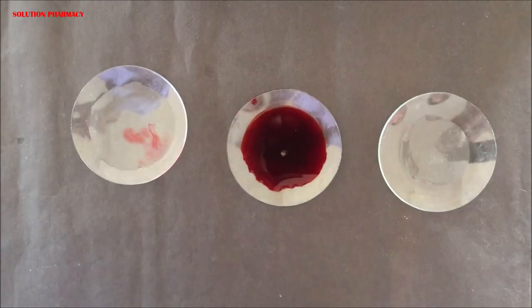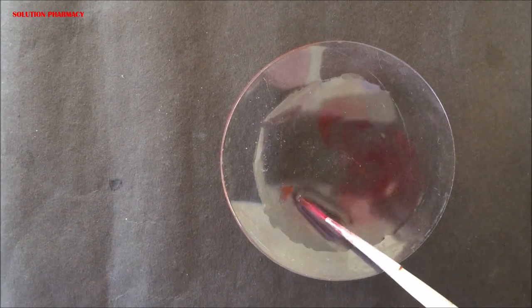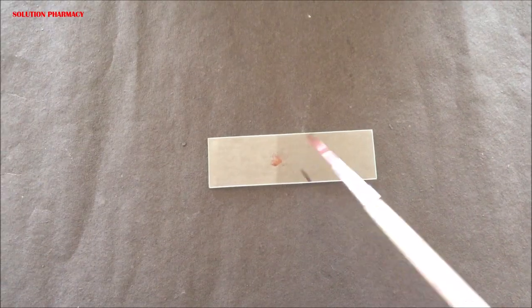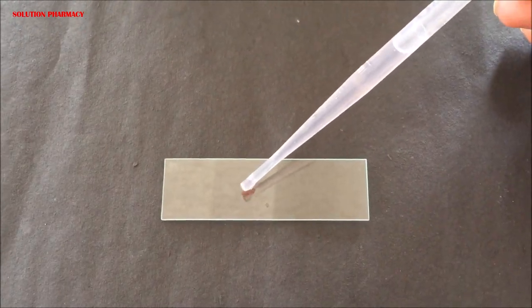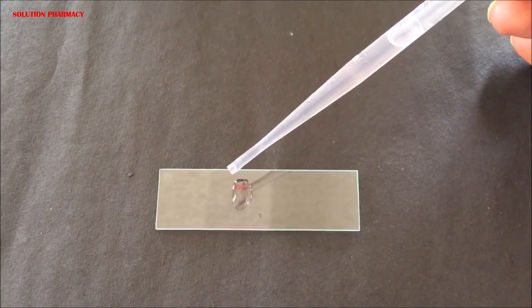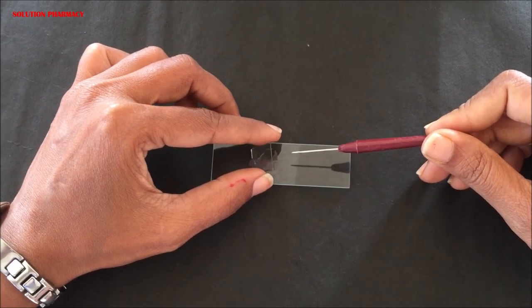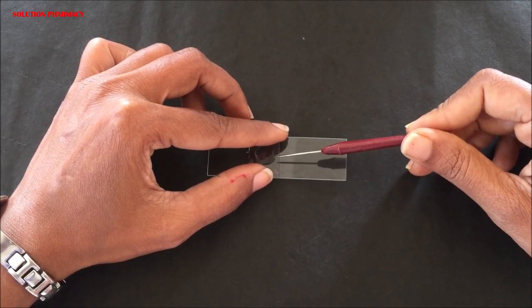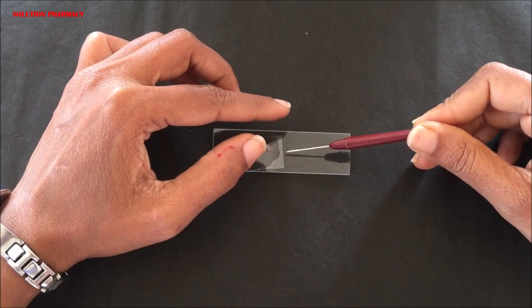After removing the excess stain, transfer the epidermal peel onto the center of a clean dry slide using a brush, avoiding any folding of the peel. Add one or two drops of glycerin solution with a dropper onto the epidermal peel, then cover it with a clean cover slip. Hold the cover slip from the side, place it vertically over the slide, hold it with a needle, and slowly lower it to avoid air bubble formation.